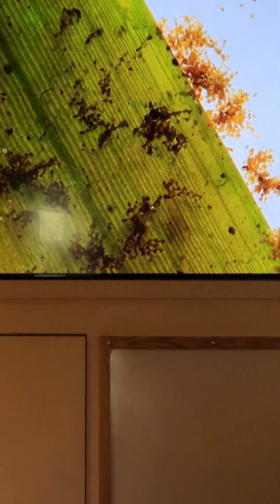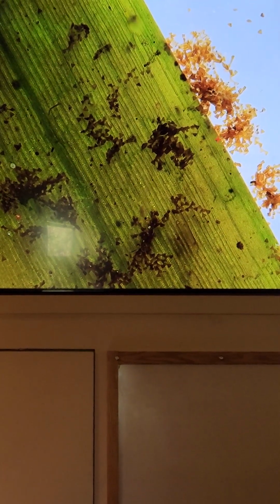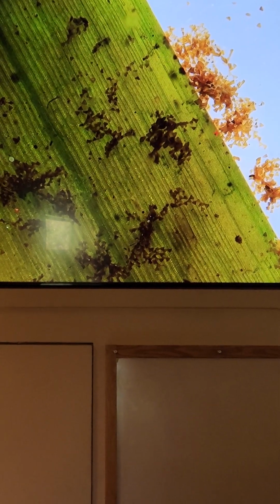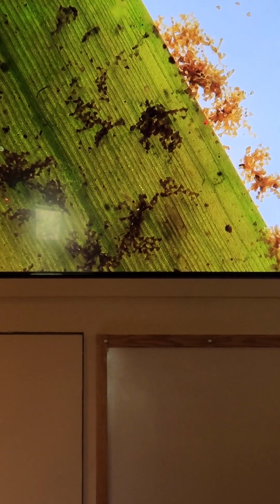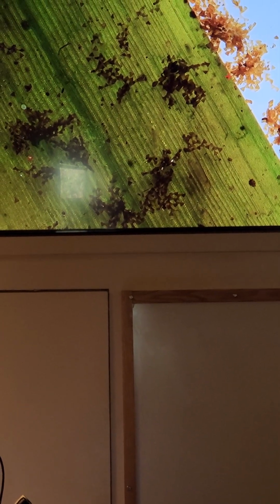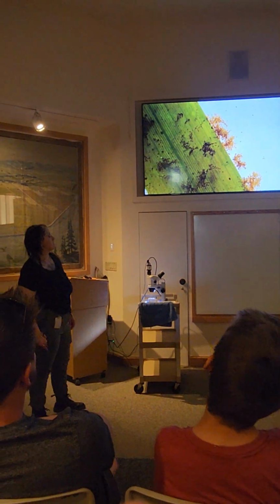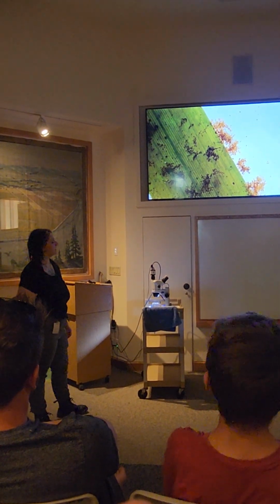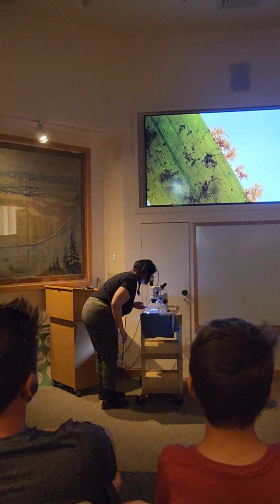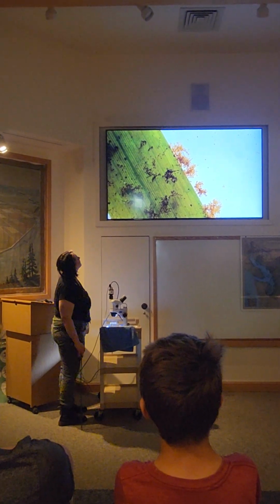I wasn't able to find them at the beach today because it was a little bit choppy. How large are the adults? Way bigger. They look monstrous, honestly. They can take up the entire screen. They can grow to be about the length of the top two parts of my cookie. So they can get visible, but they start at almost planktonic size, clearly. Yeah, because I was not able to see these guys with my naked eye. I found them under the scope.